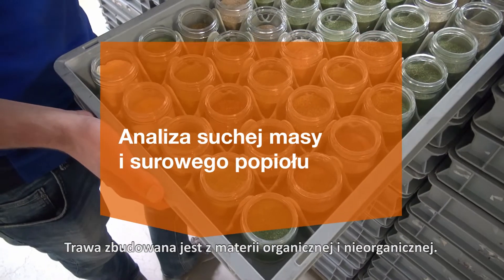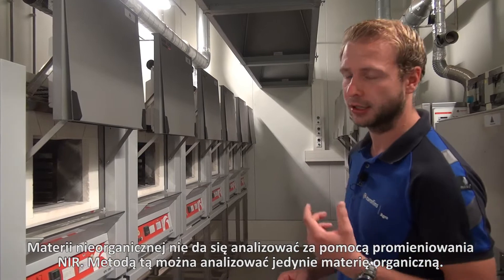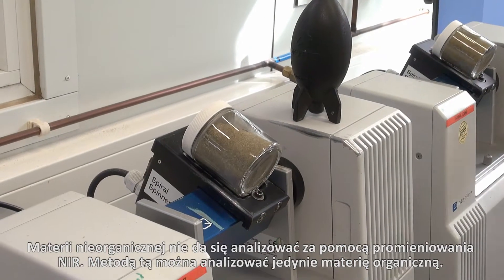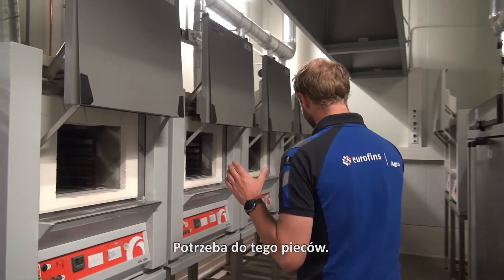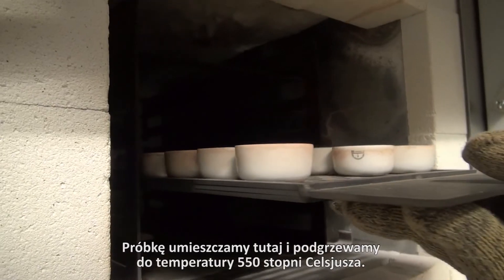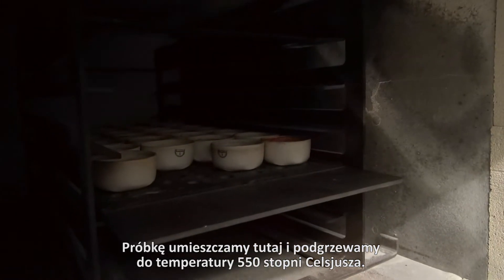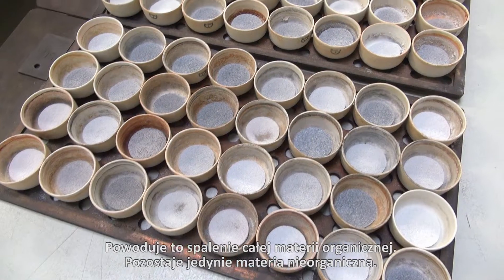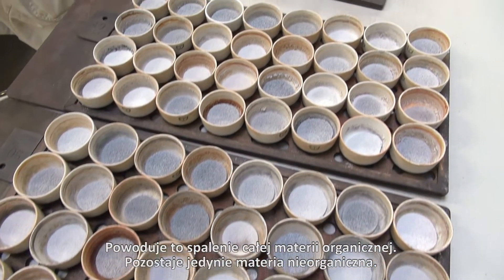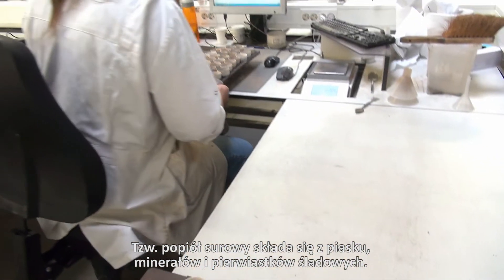These are the ovens where we analyze the crude ash content. The grass contains organic material and inorganic material. Organic material we can analyze by near infrared, but inorganic material we can't. That is done in these ovens. We fill up a sample, put them in here, and we heat the temperature up to 550 degrees. That way all organic material is burnt, and what's left is the inorganic material — and that's crude ash: sand, minerals, and trace elements.